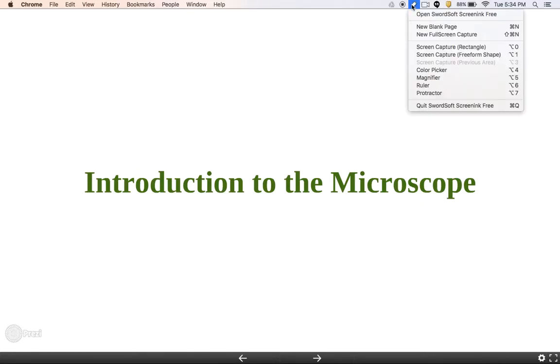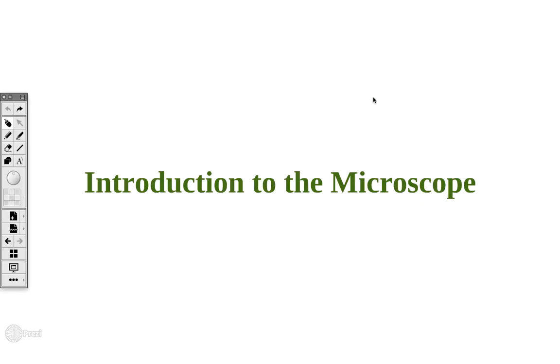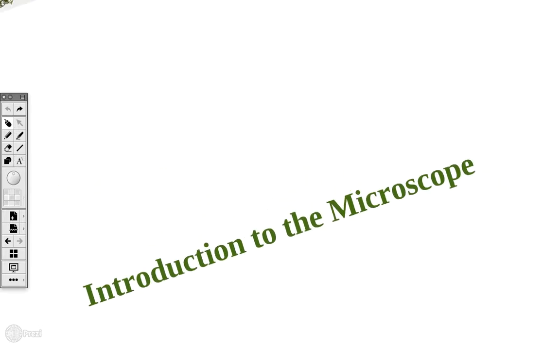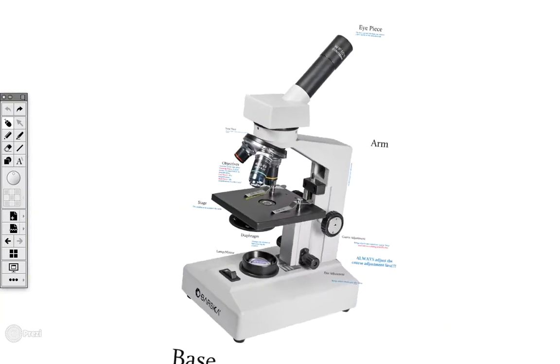Okay, today we're going to be taking notes over the microscope. So if you would take out those notes, follow along as we go through these notes, starting with what the microscope is and what it looks like.